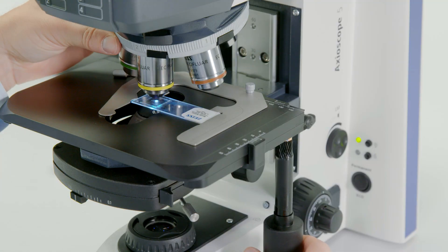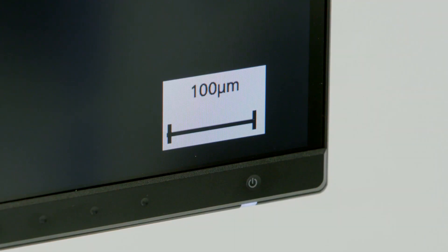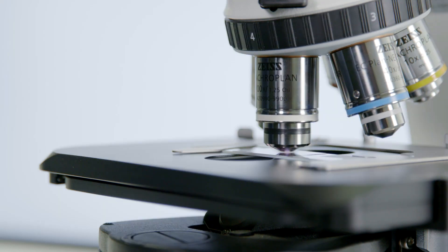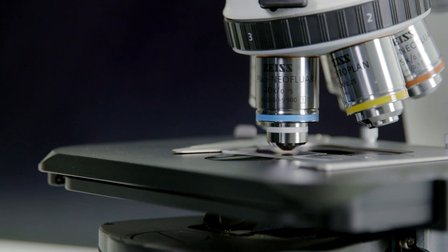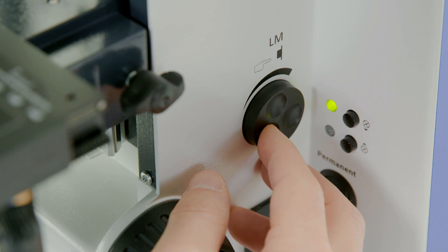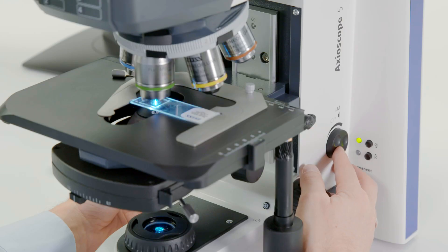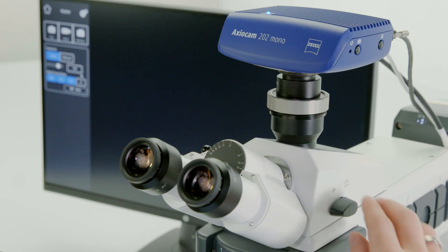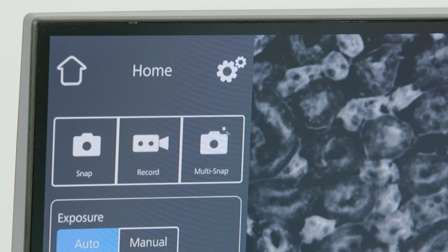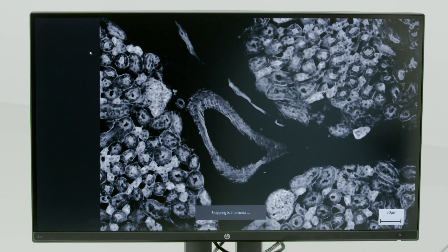Use a low magnification objective to locate and focus your sample, then switch to the magnification you need. You can control the individual light intensity of each fluorescence channel with the light intensity button on the microscope. Switch to blue excitation, change to monitor view, and focus your image again if necessary. Press snap — your system takes over.